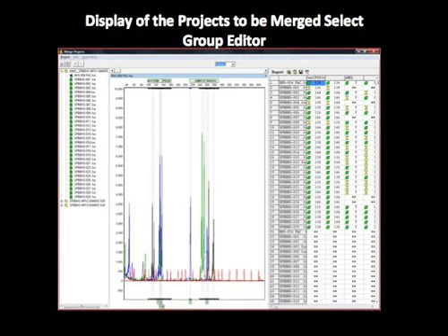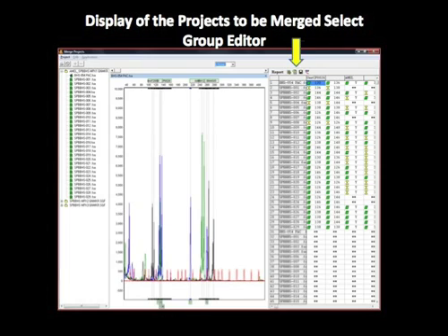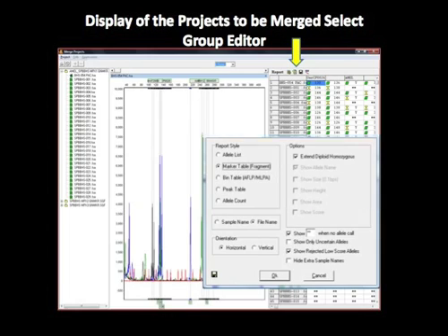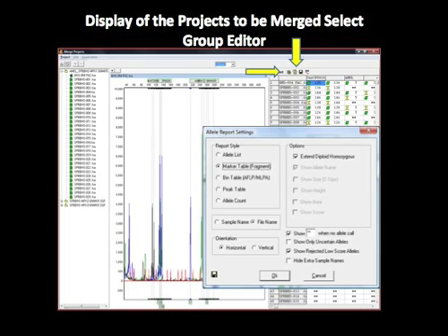The Merge Project screen will display the three project folders in the same list on the left. The electropherogram for each sample may be viewed by double-clicking on the file name. The report table is seen at the far right of the screen for each of the three projects. The report table format may be selected using the report icon with options for report style, sample naming, orientation, and additional options.